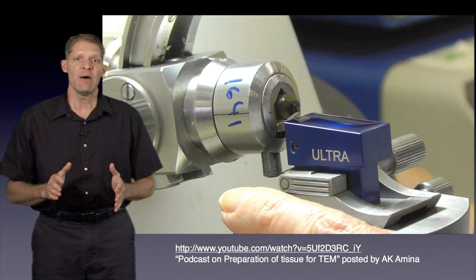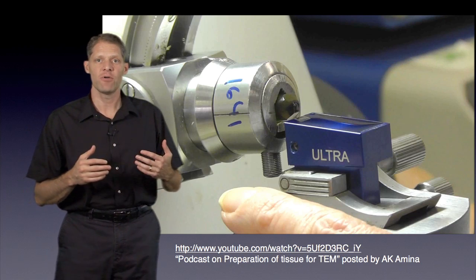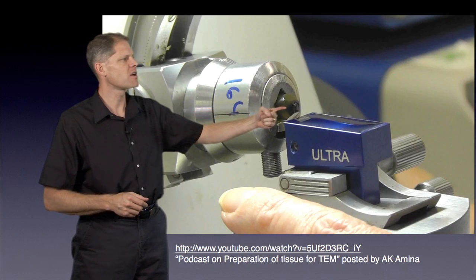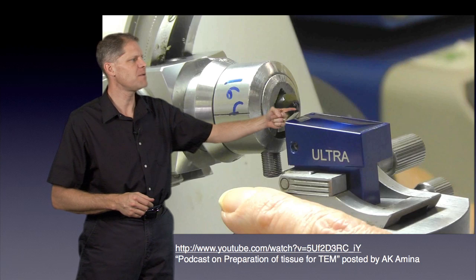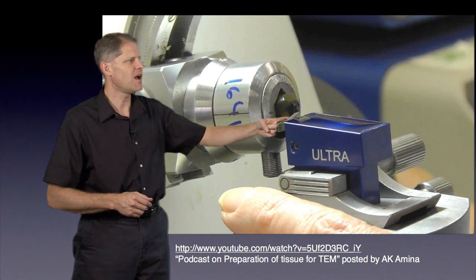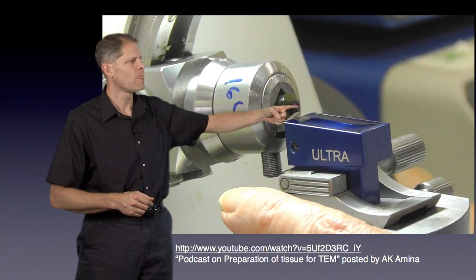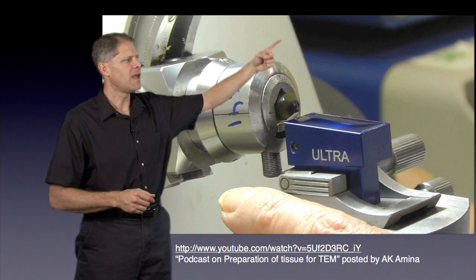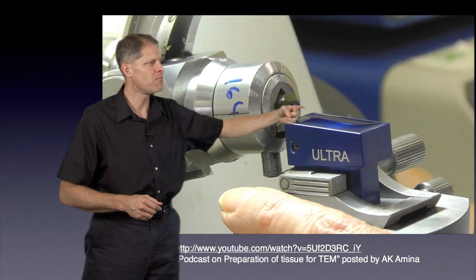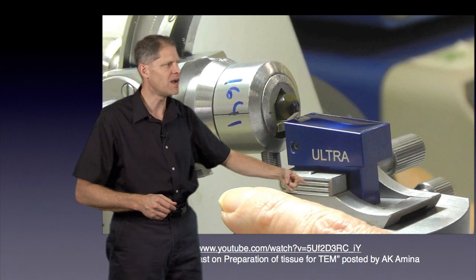Now, the sectioning step is done with an ultramicrotome, and I'm about to show a movie of how an ultramicrotome works. And what you'll see is that this is a chuck, and the sample is mounted at the very tip of the chuck. And then this blue object is a diamond knife. Actually, the knife blade is right here at the edge. And what you'll see is that the chuck moves up and down, and every time it comes down, it moves forward a little bit so that a little bit more will be cut off by the diamond blade, and then it moves forward and more is cut out by the diamond blade.